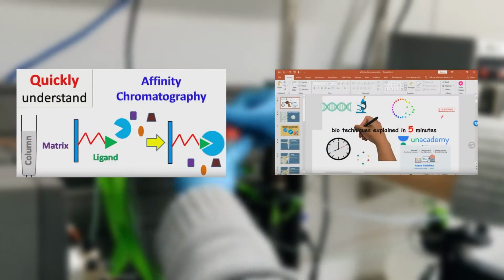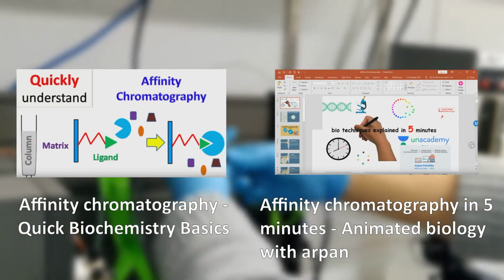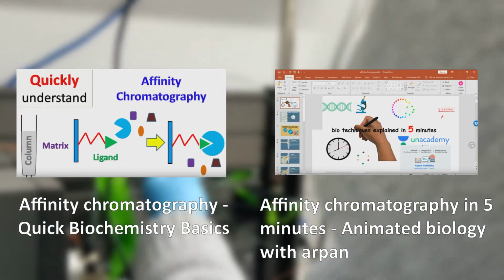Today we will be learning about affinity chromatography, an essential type of purification among many others. If you want more background regarding purification, I suggest starting with these videos. Without further ado, let's begin our journey into affinity chromatography.